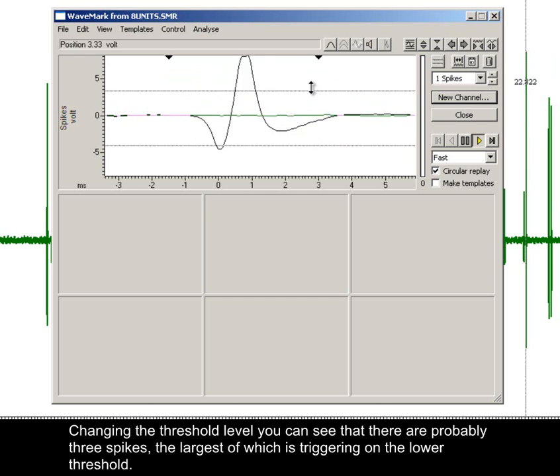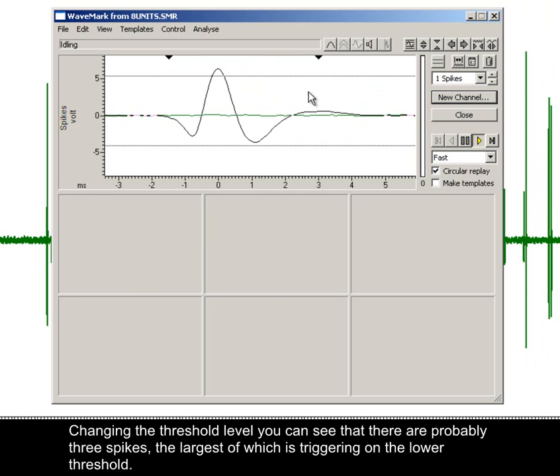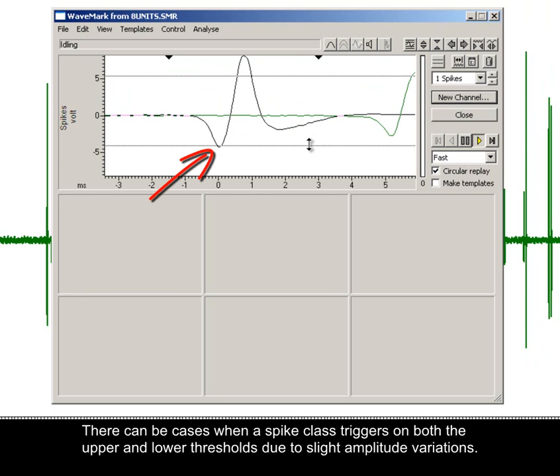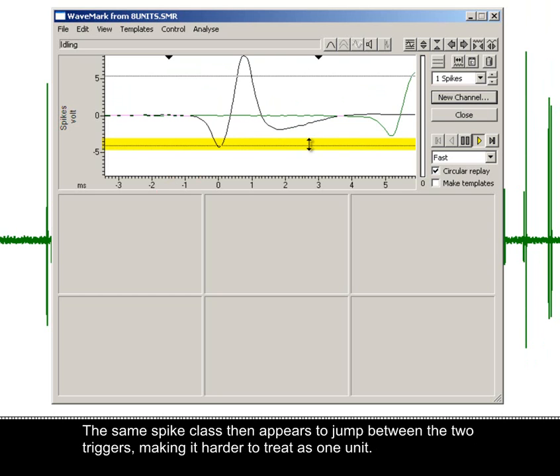Changing the threshold level, you can see there are probably three spikes, the largest of which is triggering on the lower threshold. There can be cases when a spike class triggers on both the upper and lower thresholds due to slight amplitude variations. The same spike class then appears to jump between the two triggers, making it harder to treat as one unit.